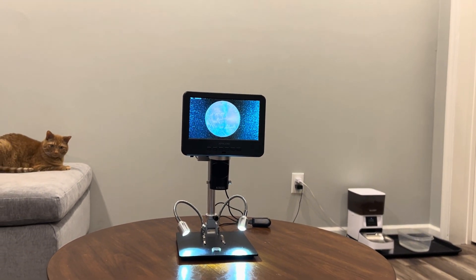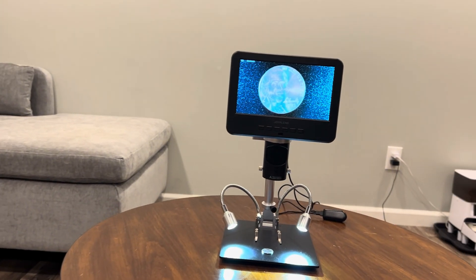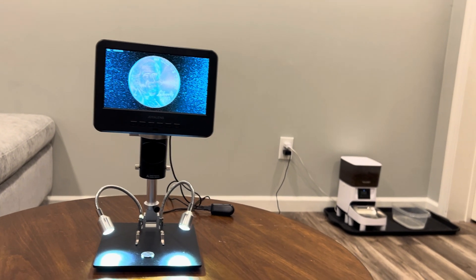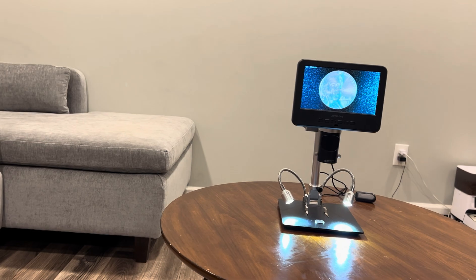In today's video, I'm going to unbox this device, walk you through its key features, test it out with some real-world samples, and let you know if it's worth the investment. So if you're thinking about upgrading your microscope setup or just curious about how this one stacks up, keep watching.